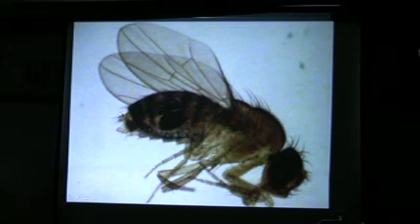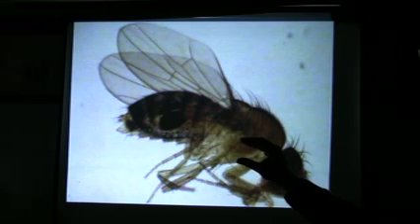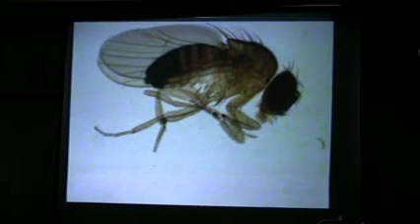Ovipositor. Totally different than the male. You see that? It's like this. I hope it's in the camera. Is my hand in the camera? Yeah. Like this. But the male, if you want to go back, does not have that. It just has this pygidium at the end. It looks like a pygidium. You see that? Am I making some sense?